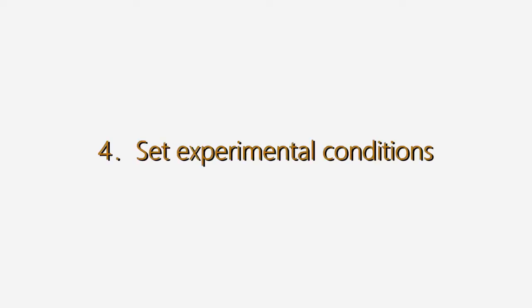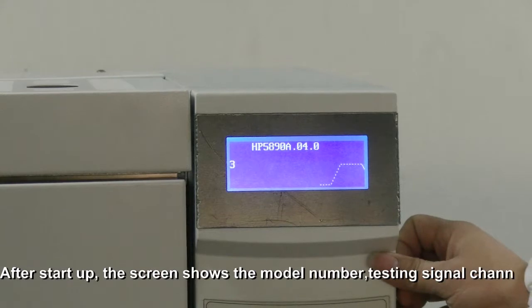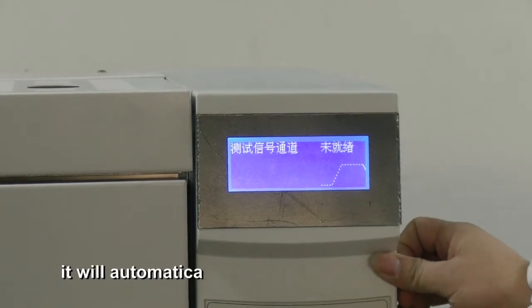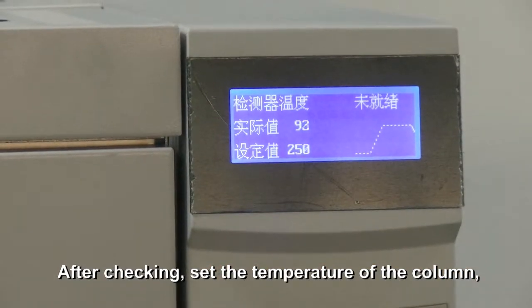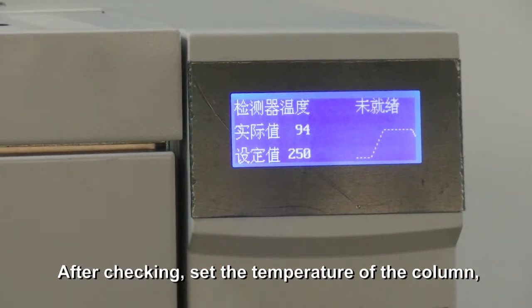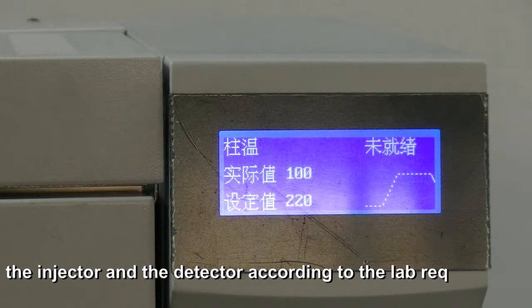Set experimental conditions. After startup, the screen shows the model number testing signal channel. It will automatically go to the self-checking program. After checking, set the temperature of the column, the injector, and the detector according to lab requirements.